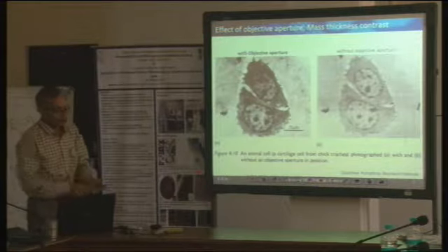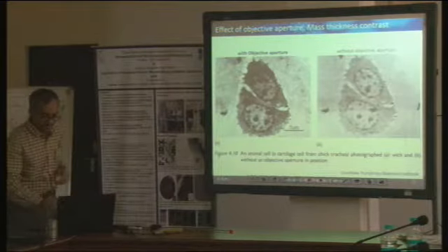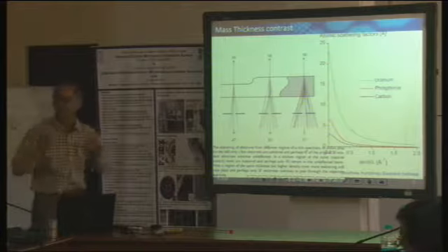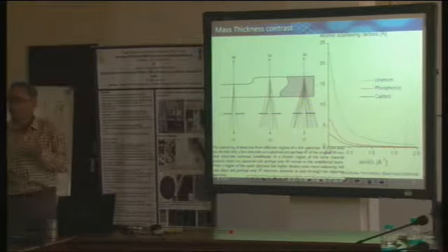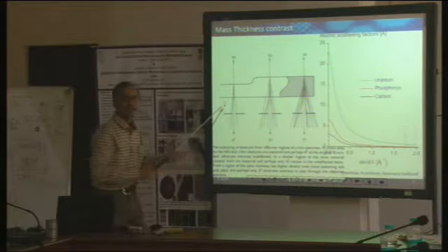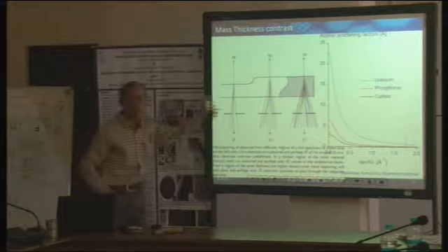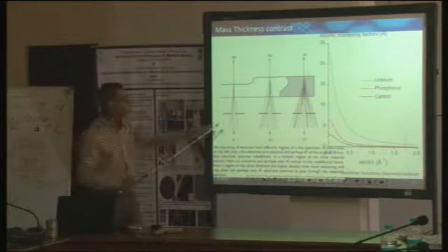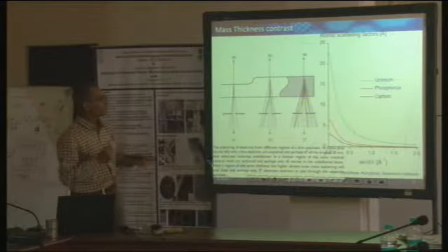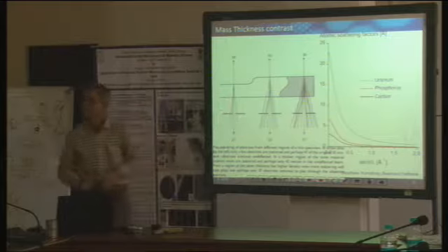Now there is one more case which has come up, and let's discuss it. Let's think of an experiment where I have a sample like this, and the scattering will happen, and I don't use any objective aperture. I just make an image just like that. What will be the problem in that case? Because all the... pardon?